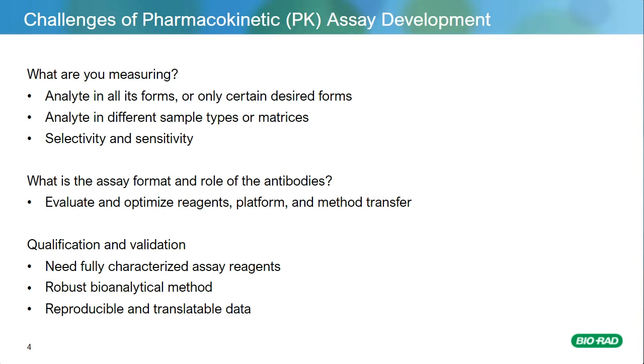Secondly, we've got to think of the antibodies we're producing themselves. What format are they in? What assays are they going to be in? What role are they going to play within those assays?